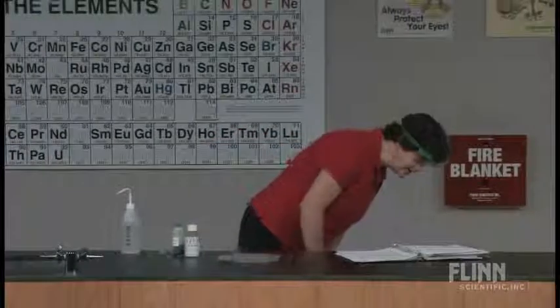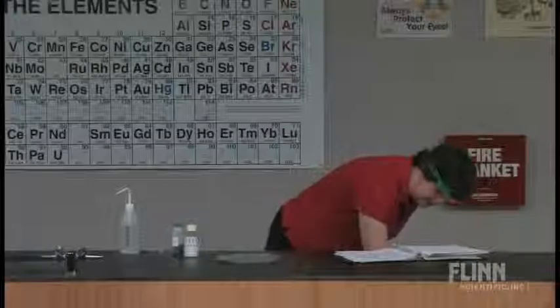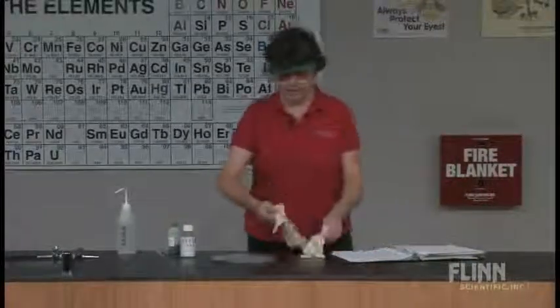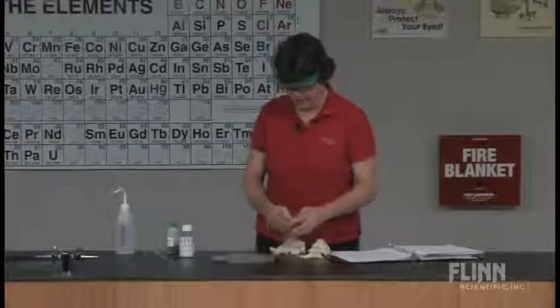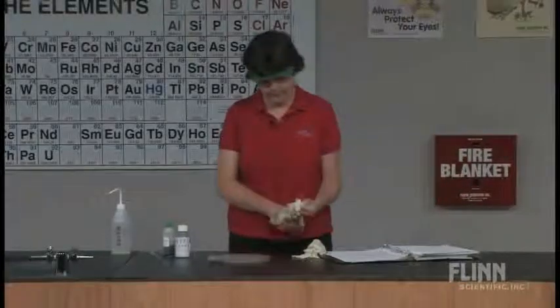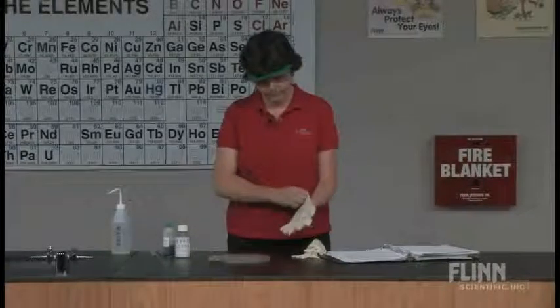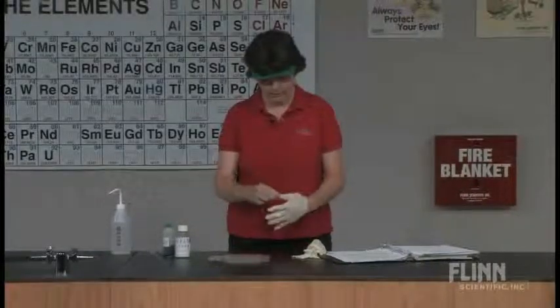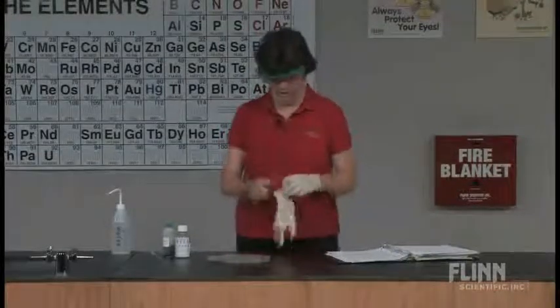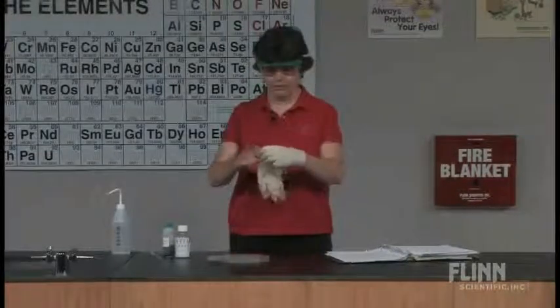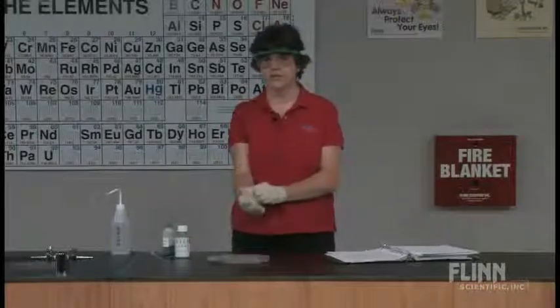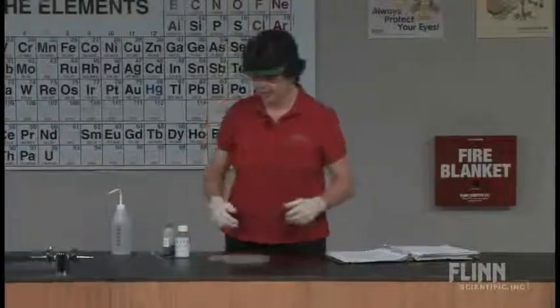We've got concentrated nitric acid. I don't want that on my hands, so I'm going to put some gloves on. If you've ever had nitric acid on your hands, you'll know why; if you haven't, don't experience it — it's not very fun. It turns your hands all kinds of shades of yellow and brown and black.